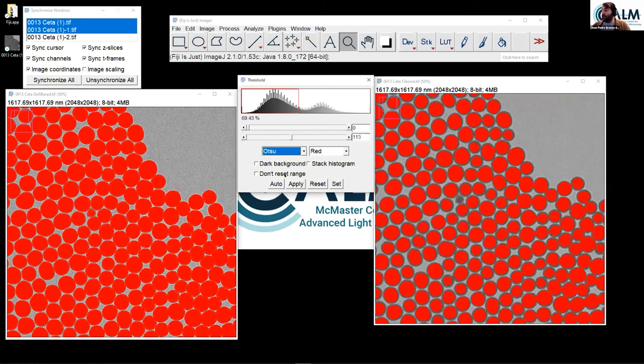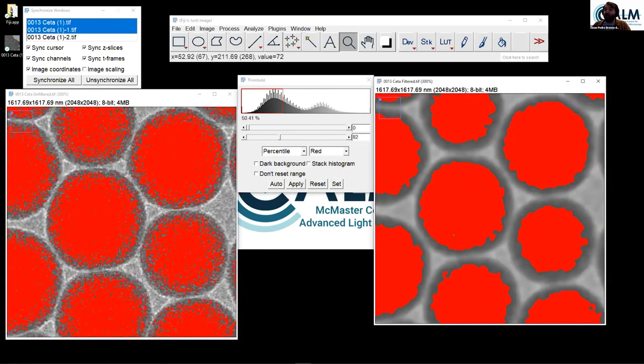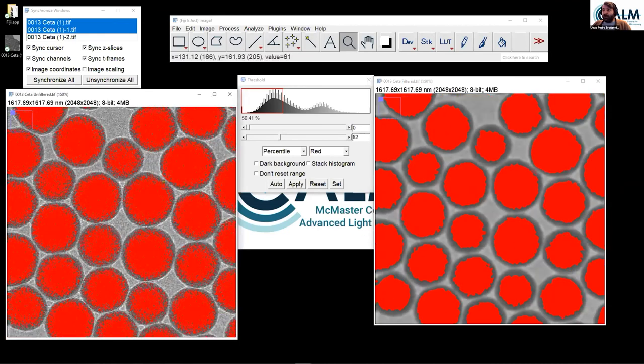slightly different. You see, whereas here I have a homogeneous structure, a homogeneous object, on the image on the left, because I did not filter it in the past, I have this speckle still present. And this can be an issue, as you'll see afterwards, okay? Any questions so far? So far, so good.